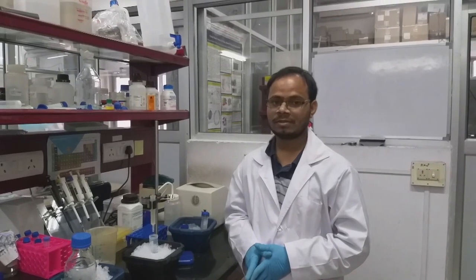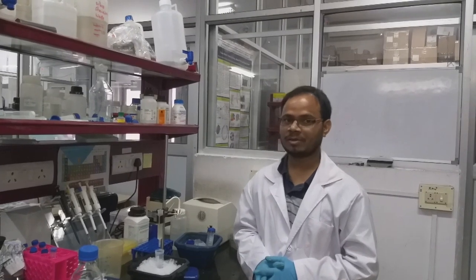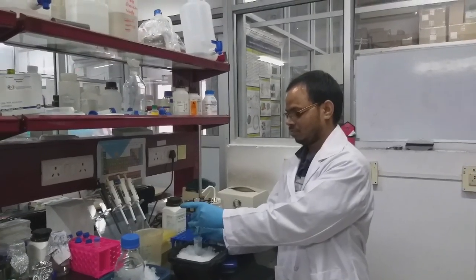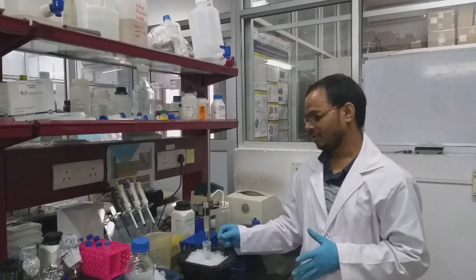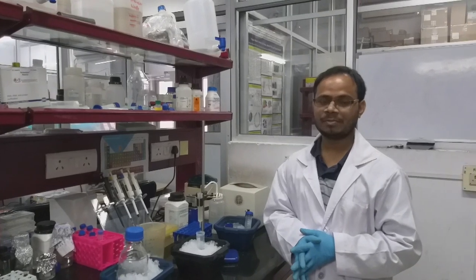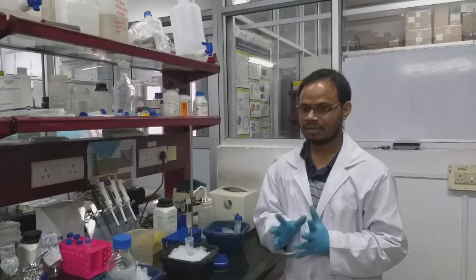After incubation with beads, we have to follow another 3 steps to get complete purification done. First, after the beads are taken out from ice, you have to remove the outlet so that all the flow through other than beads will be taken out. The next step is we have to wash with the equilibration buffer. And the third step is we have to elute the histidine protein using imidazole containing buffer.